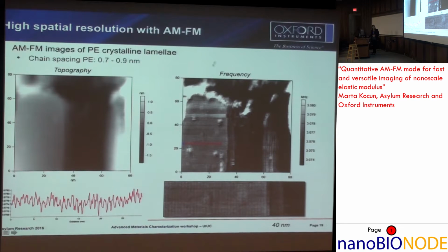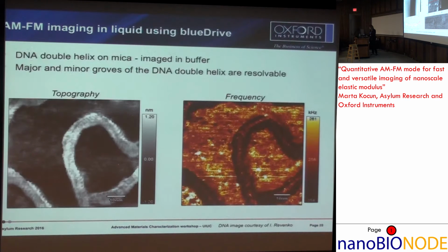What we're currently looking at is, this is the area which is the crystalline part, where the polymers are really nicely aligned, but what you're seeing here is actually the amorphous part of the polymer chain. So it's coming out of this crystalline structure and being amorphous before it goes to another crystalline area. This is something that is of interest to people who do research on these polymers.